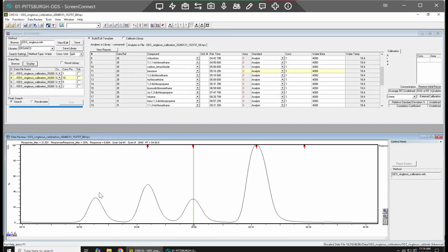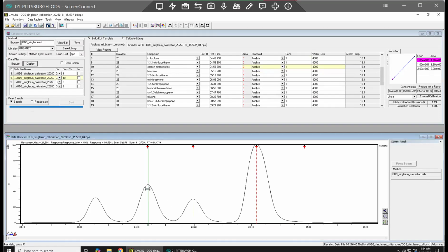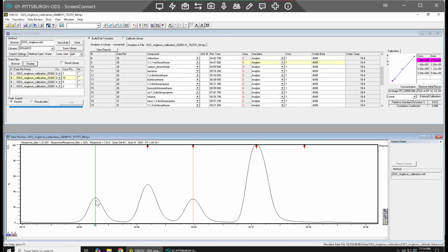And then I know definitely that chloroform, 1,1,1, and carbon tet are triplets, like in a row. So it makes more sense that this is the benzene over here. So anyway, this would be the carbon tet, so 459. And then this one, 447. And then chloroform, 434.